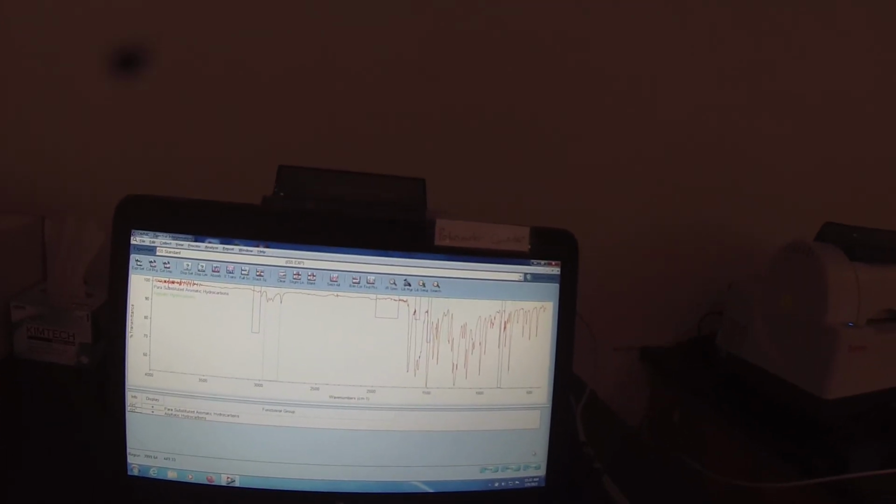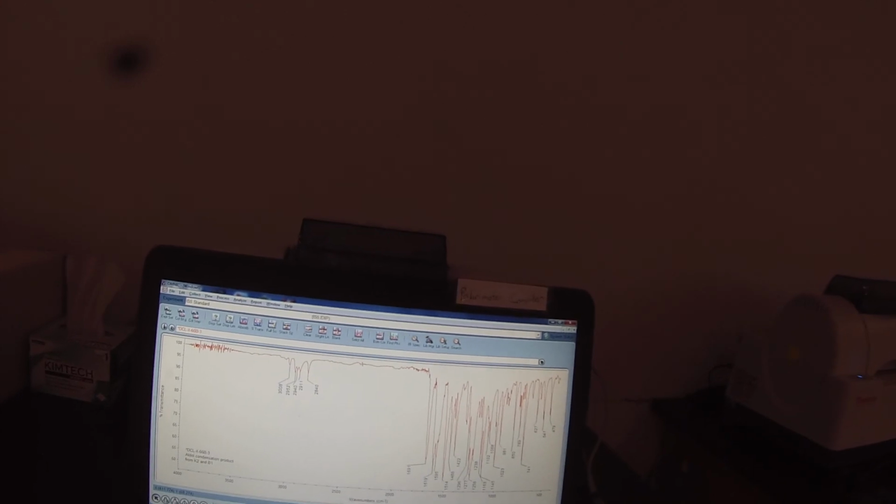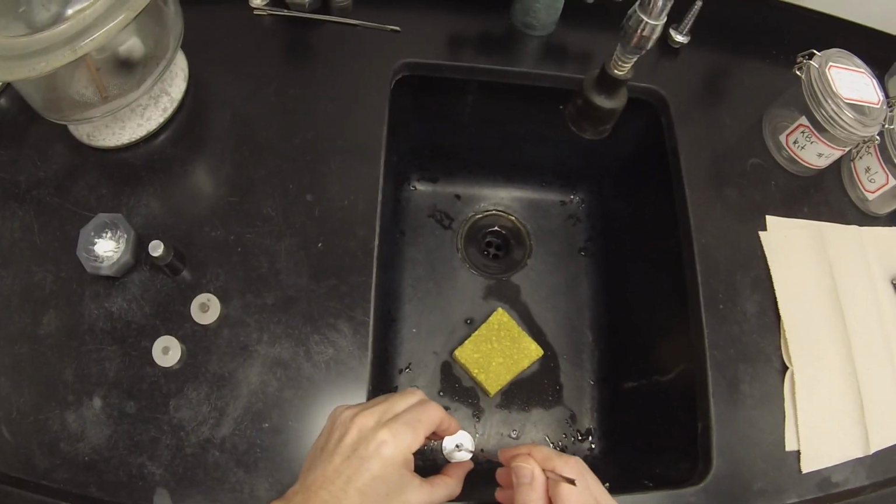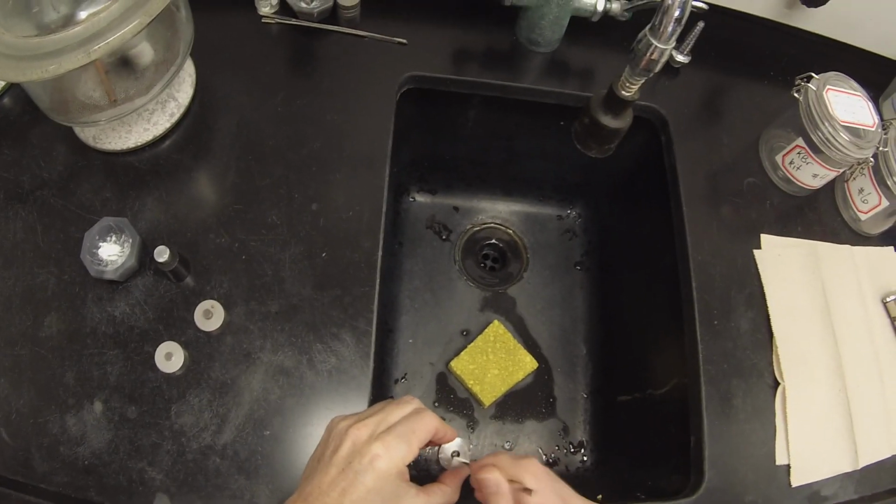And we'll combine those for upload. So that's the IR spectrum. Let's leave Omnic open and we'll just take that and dispose of it. Punch that out into the sink with our little spatula.